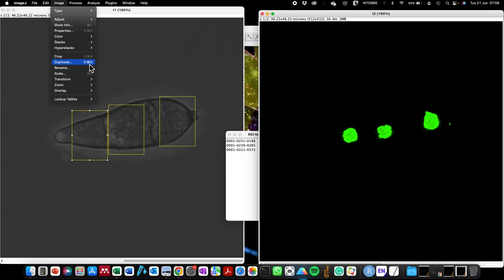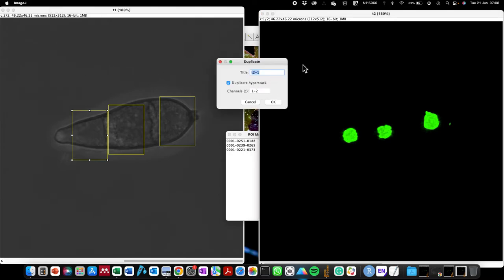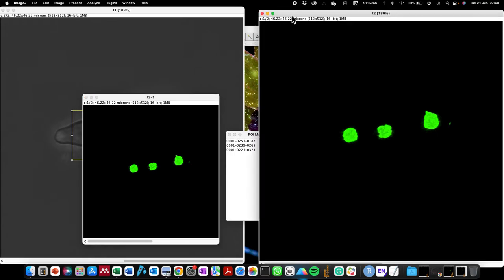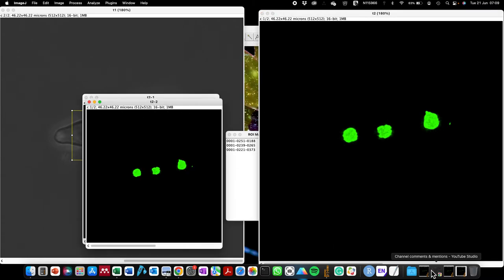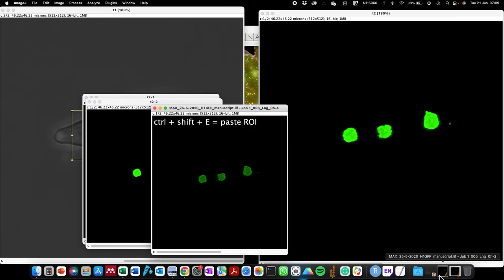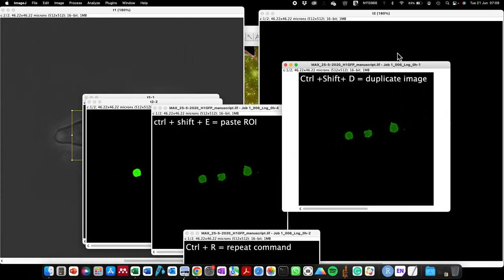That other symbol is for the Command key, and the letter D. So instead of clicking through the menu to duplicate the image, I can press Command + Shift + D on my keyboard and then press Enter. You can see that also duplicated the image. So to perform image duplication, Command + Shift + D will duplicate the image, as I just demonstrated.